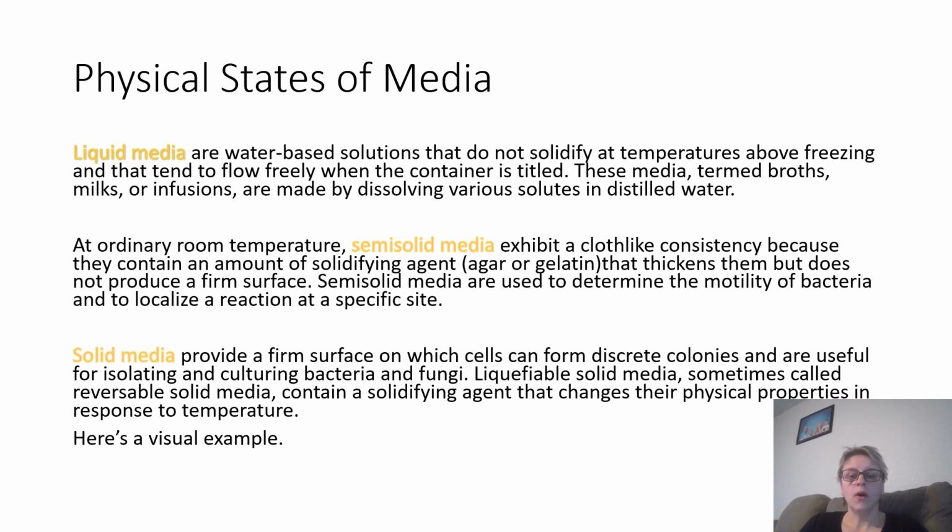Semi-solid media are used to determine the motility of bacteria and to localize a reaction at a specific site. Solid media provide a firm surface on which cells can form discrete colonies and are useful for isolating and culturing bacteria and fungi.